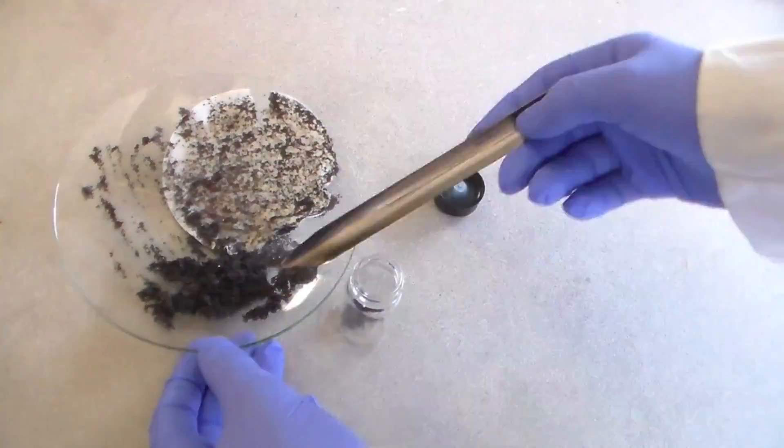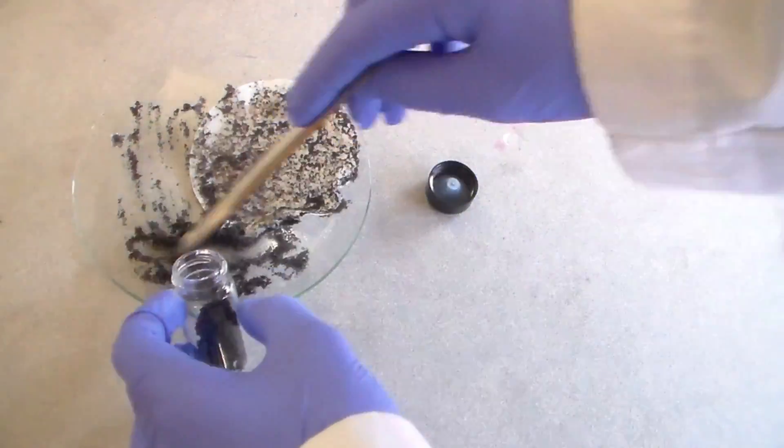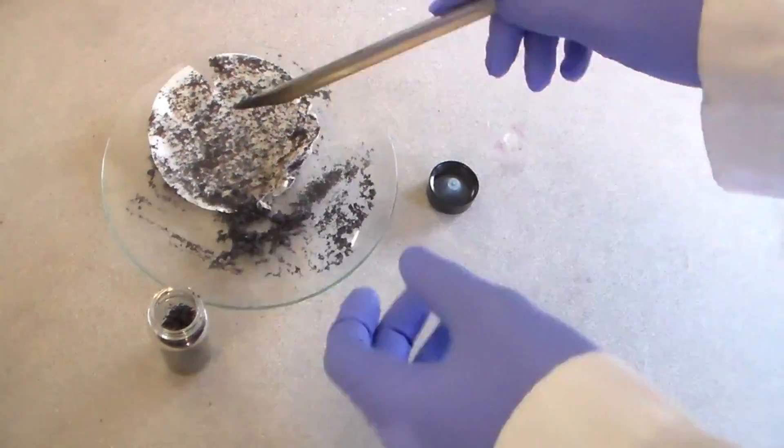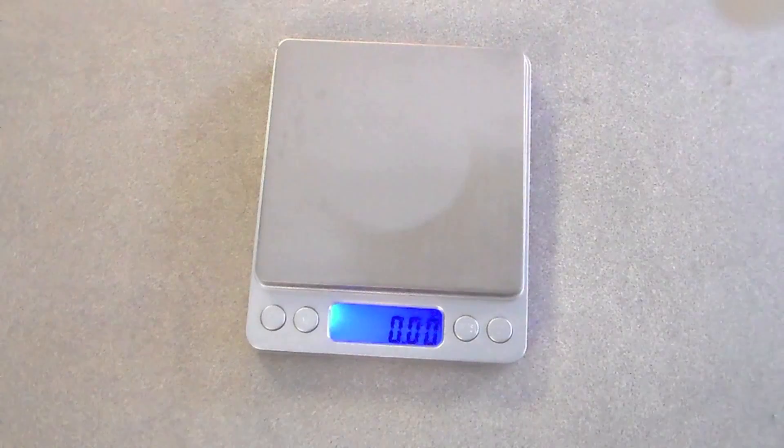After letting the solids dry, I transferred them to a vial. It was at this point that I realized that I had forgotten to weigh the product and determine percent yield.